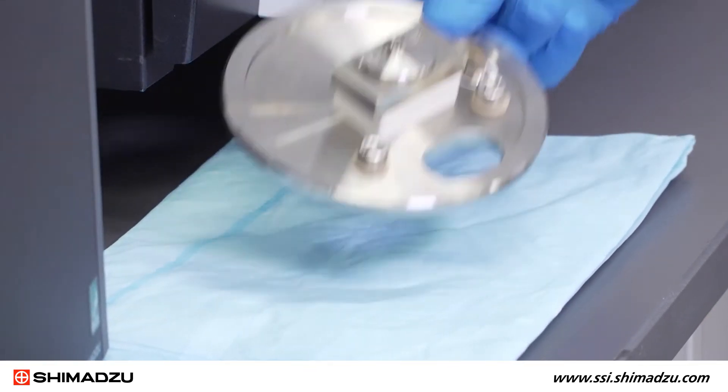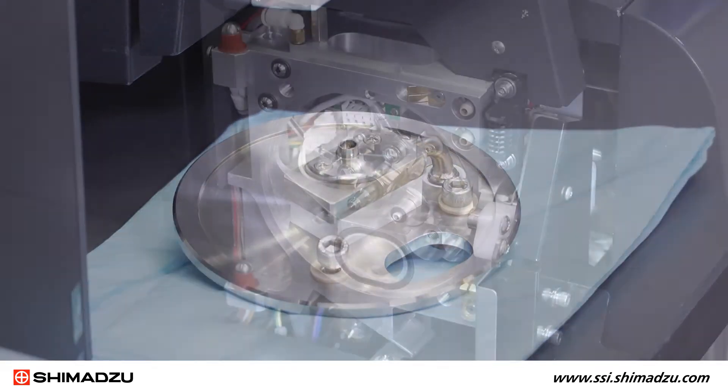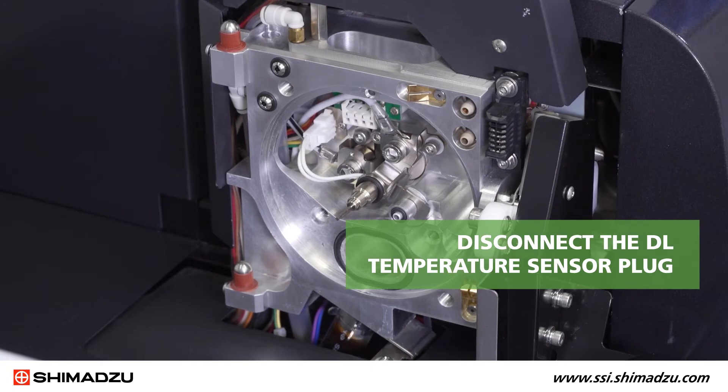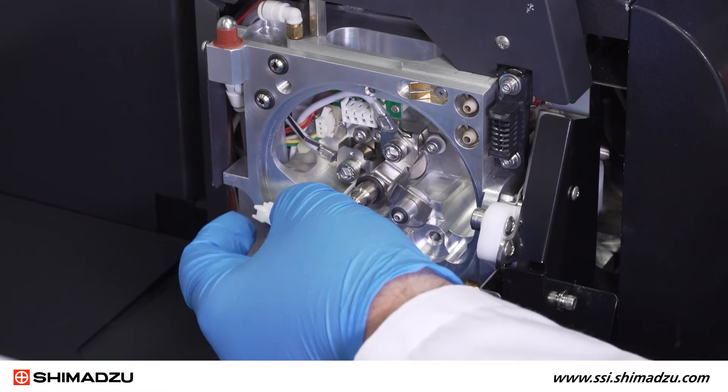Once the flange has been removed, set it aside on a clean surface. Disconnect the DL temperature sensor plug on the left side of the desolvation line. Squeeze the plug to unlock it.